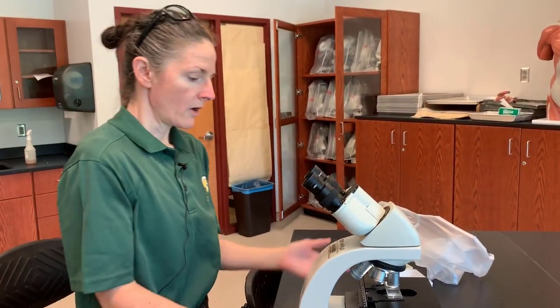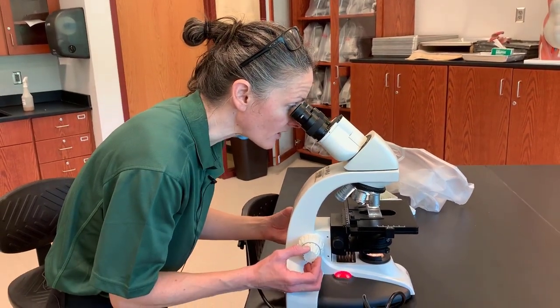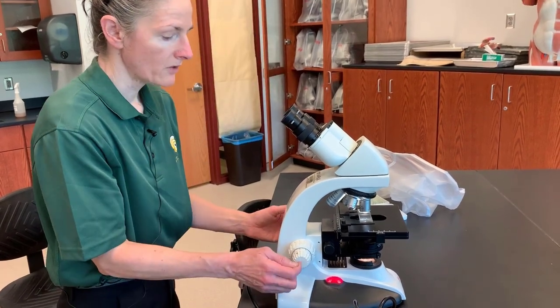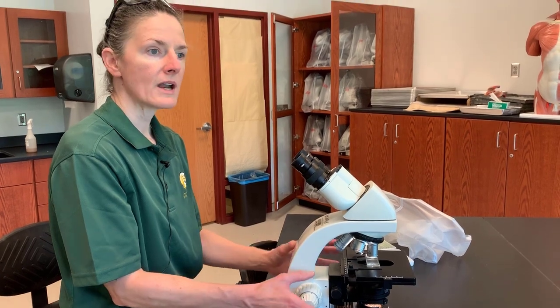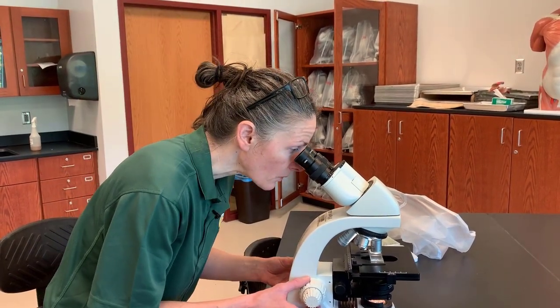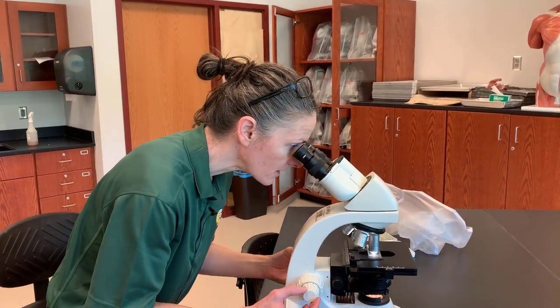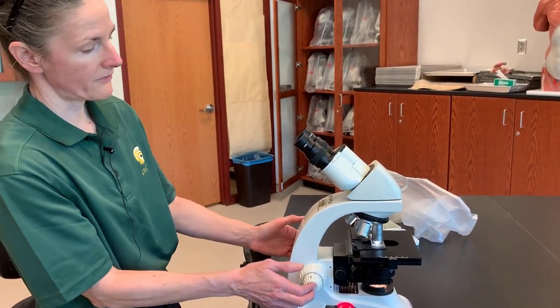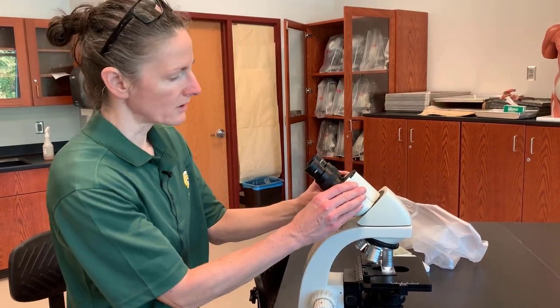Once I have adjusted it at the scanning lens, I can see it very clearly here with very little adjustment. At this point, we use only the fine focus or fine adjustment knob. We never touch the coarse focus again. Once we have done that, we can move up to our high power objective. A quick twist with the fine focus brings the subject into focus and we can see it clearly.